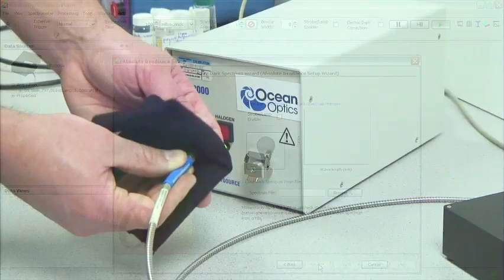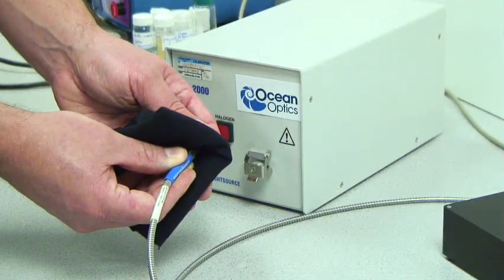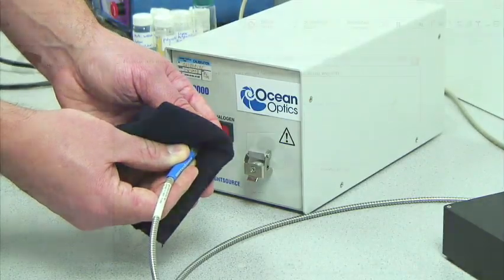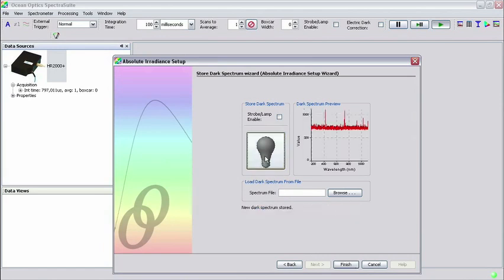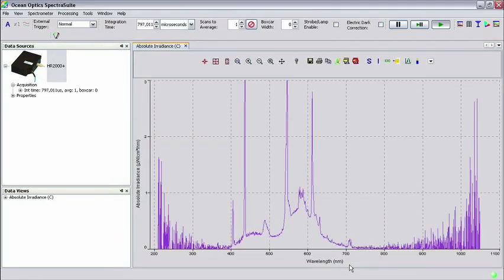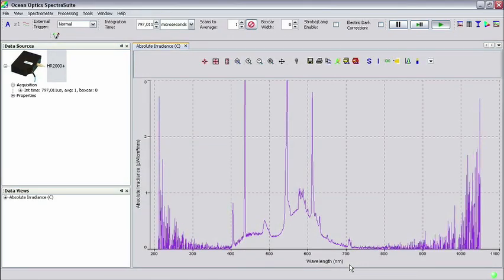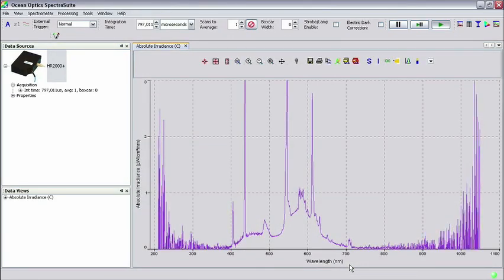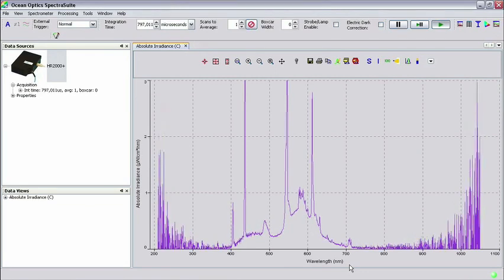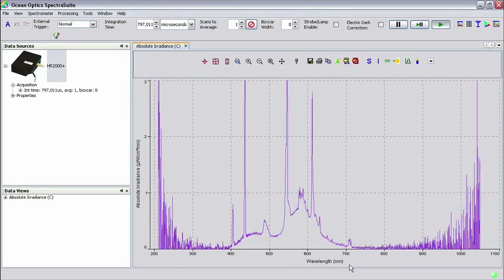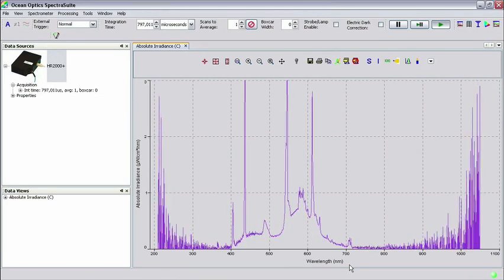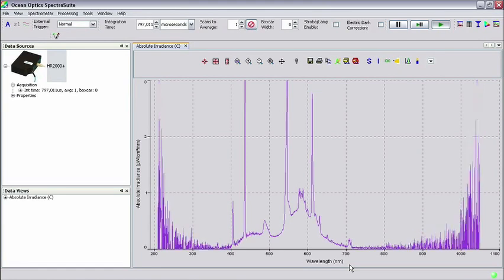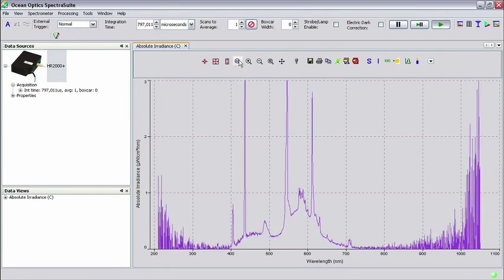Covering the cosine corrector with a light blocking substance, click the gray lightbulb button to update the dark spectrum. Clicking on Finish brings up the absolute irradiance spectrum graph. The noise on either end of the spectrum is due to lack of signal in those regions. In the range of 400 to 750 nanometers, we see the typical spectrum for fluorescence lighting.